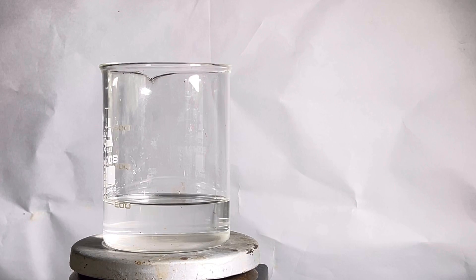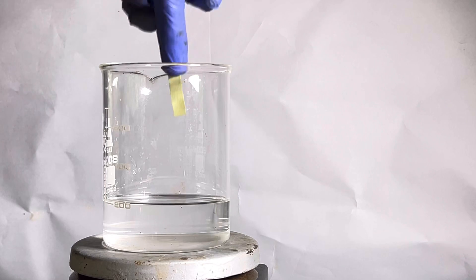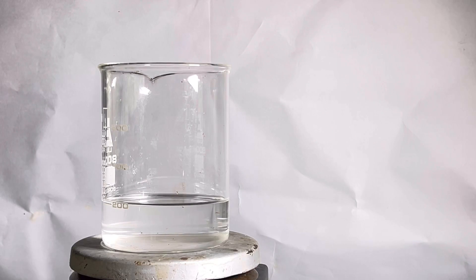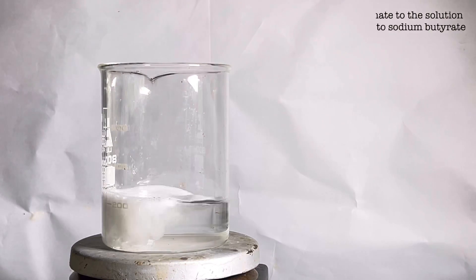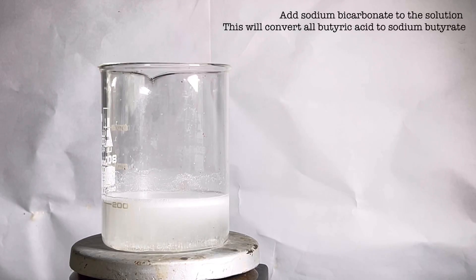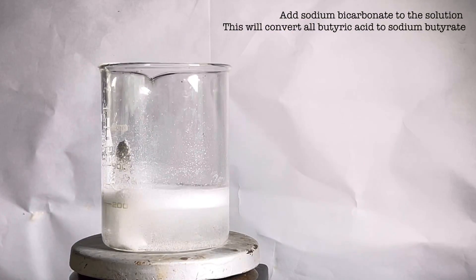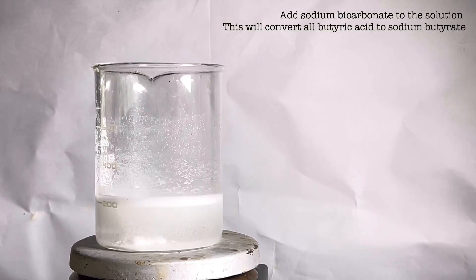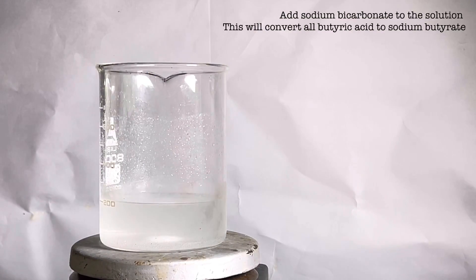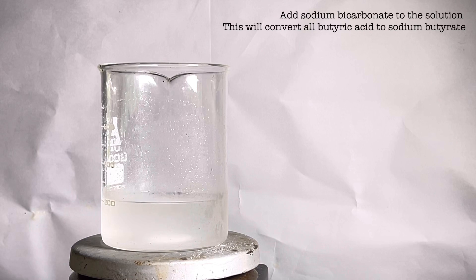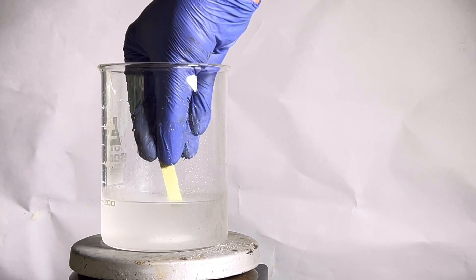Moving on with the synthesis of butyric acid we will take the aqueous part of the distillate in a beaker. A quick pH test was done and the acidic pH was confirmed. Next we will start adding sodium bicarbonate to the solution. Effervescence is seen as carbon dioxide is produced. What we are doing here is converting all the butyric acid to its sodium salt form sodium butyrate. Sodium butyrate is soluble in water and is insoluble in the solvent called ethyl acetate. Ethyl acetate is used to rinse the solution and extract out many side products and unreacted material from the solution. Finally when no more effervescence is seen pH was tested again and it was found to be alkaline.